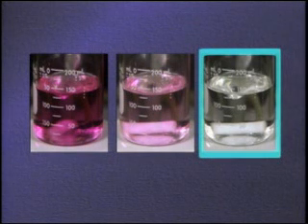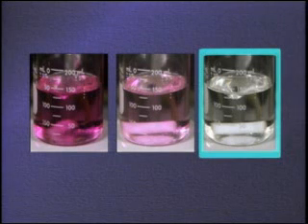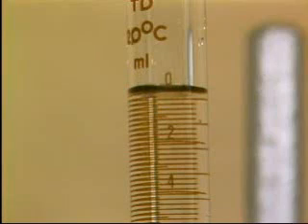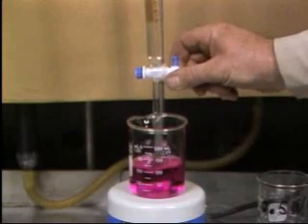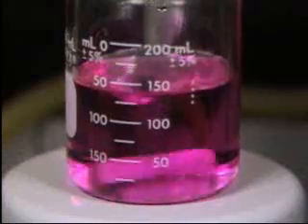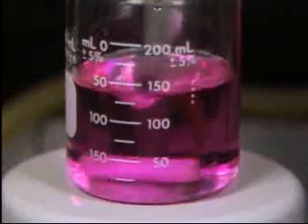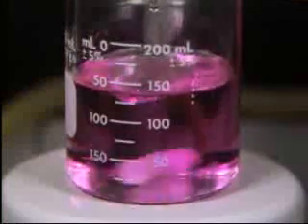Since our example involves a neutralization reaction, the reaction is complete, or the endpoint is reached, when the alkali in the sample has been neutralized. After the level of acid in the burette is checked, the titration can begin. The valve on the burette is opened, allowing the acid to drain into the beaker. When the color of the sample begins to change, the valve is closed almost completely. The valve is left open just slightly to allow the acid to drain out a drop at a time.